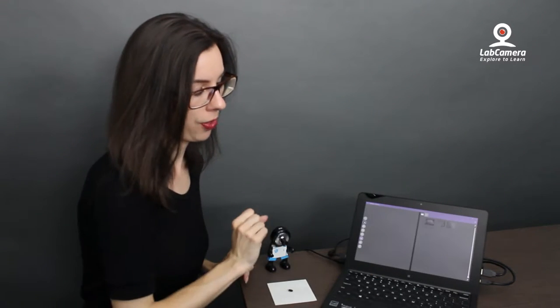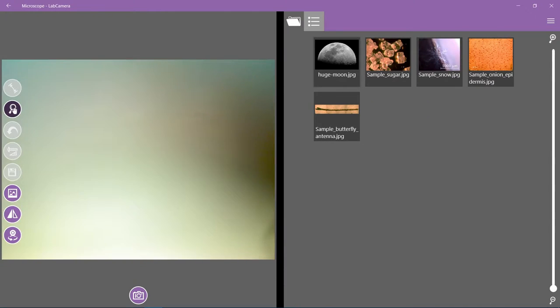I'm going to use Lab Camera's microscope function and this camera, which has manual focus. Here we go!